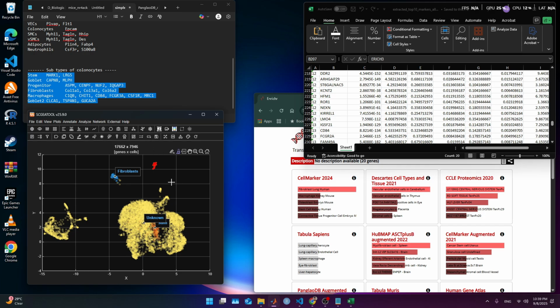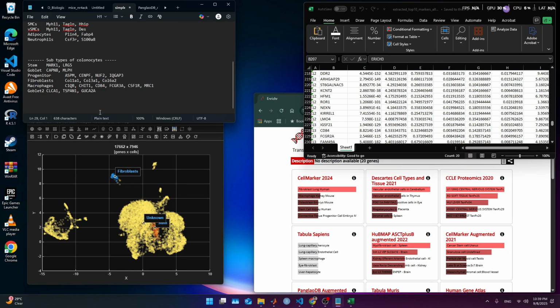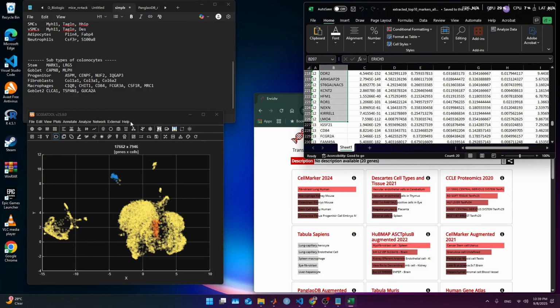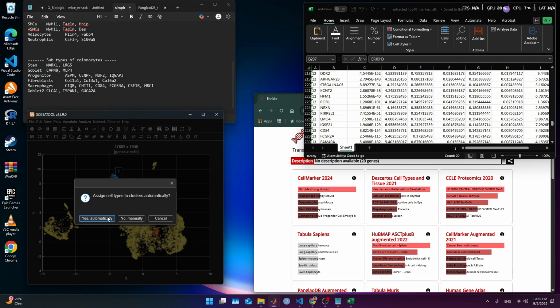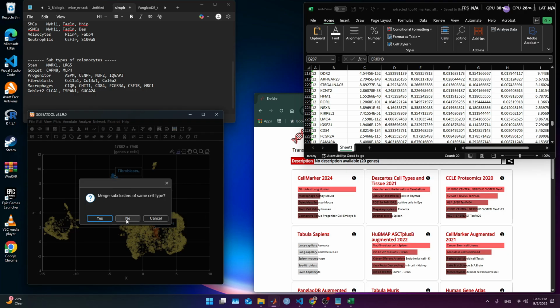So here our alternative that building our clusters markers didn't work. We are gonna do a different venue. So we are gonna do cluster ID, and we are going to annotate with the Panglao automatic. So it's gonna be an iterative refinement. So the thing is that there are some gene markers that are not expressing too much. That's the main problem.